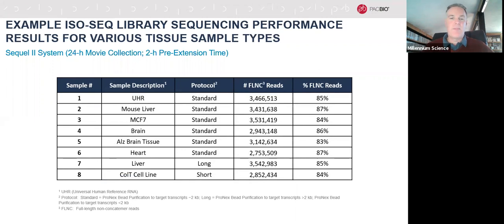But here, more real life, that human reference sample is included. But then there's some other typical tissue samples that you might be looking for transcriptional information in, where it doesn't give organism as human, but otherwise it's mouse here.